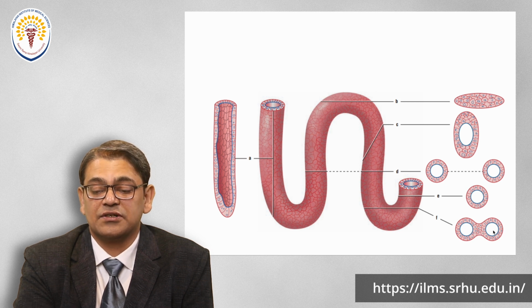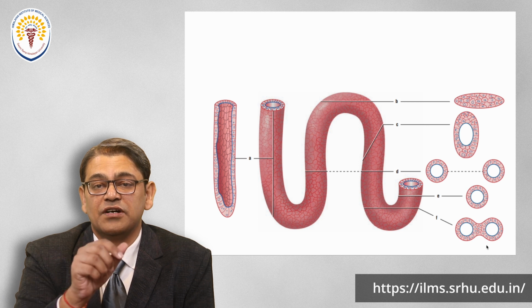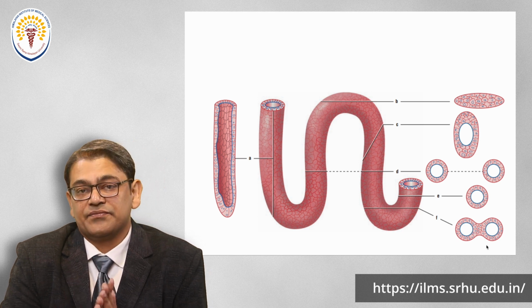Though the area is not connected, if you imagine, these are connected tubes. They are not two tubes, they are one tube visible as two because of the curving at this level.